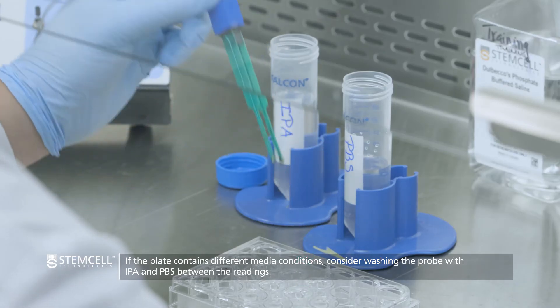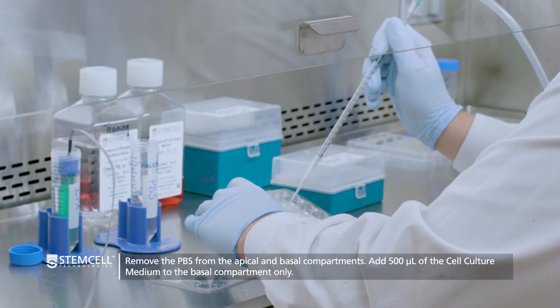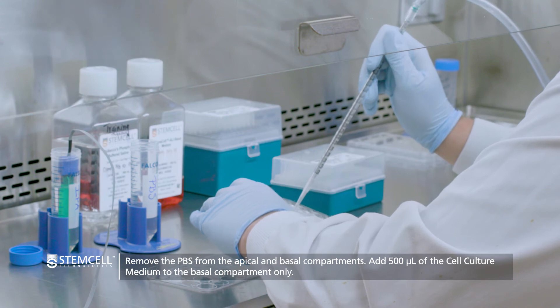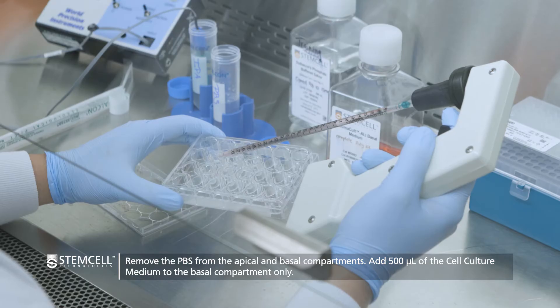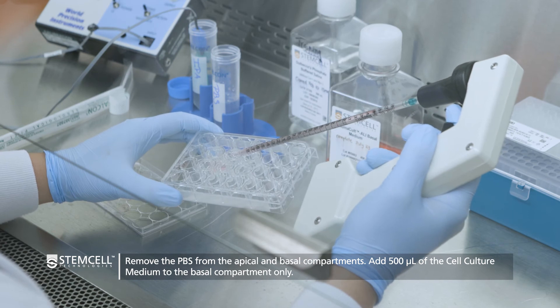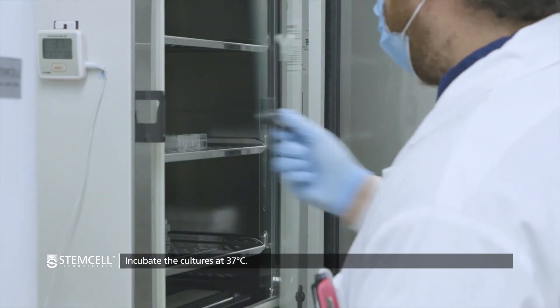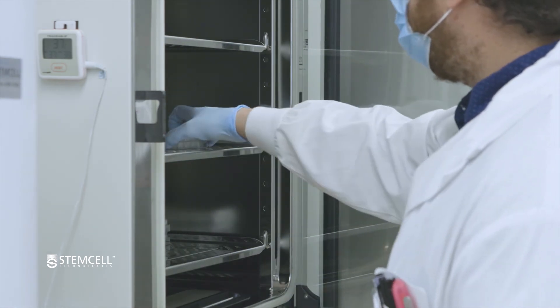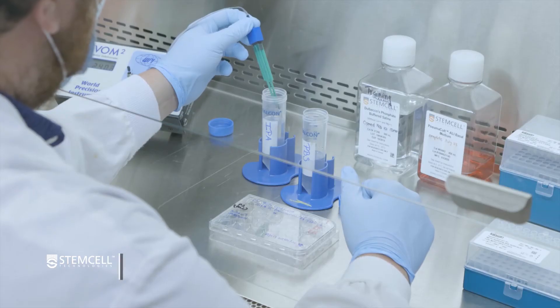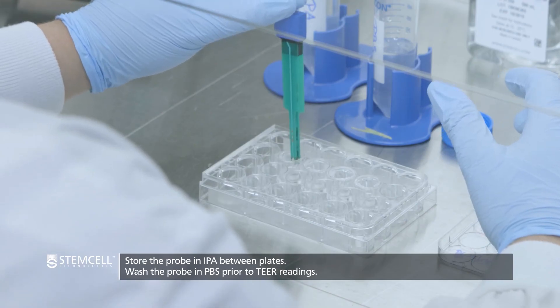Move the probe to the next ALI culture and continue collecting the OHM values for the entire plate. Once all the OHM values are recorded, submerge the probe back in IPA. Remove the PBS from the apical and basal compartments and add 500 microliters of cell culture medium back to each culture's basal compartment. Return the ALI cultures to 37 degrees Celsius. If switching between plates, ready the next plate for measurement, wash the probe in PBS, and continue to collect the next TEER readings.